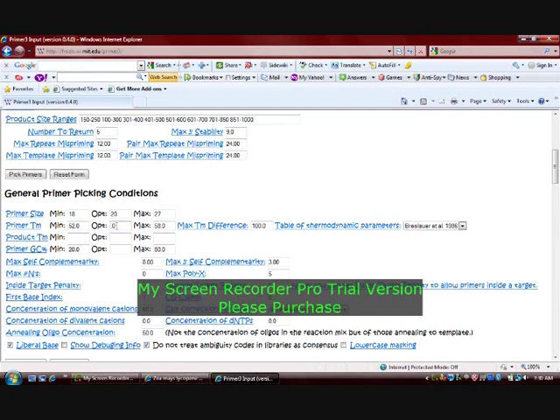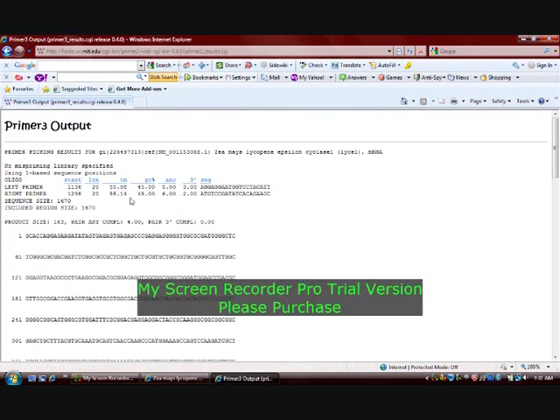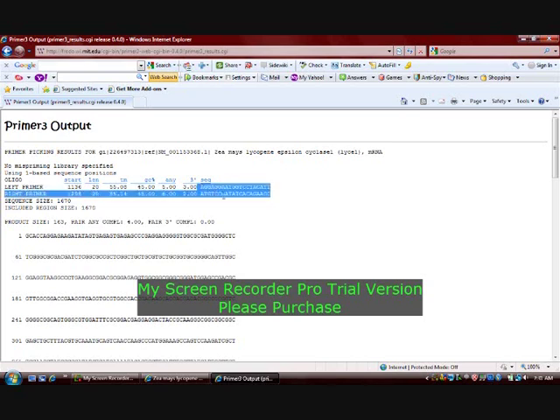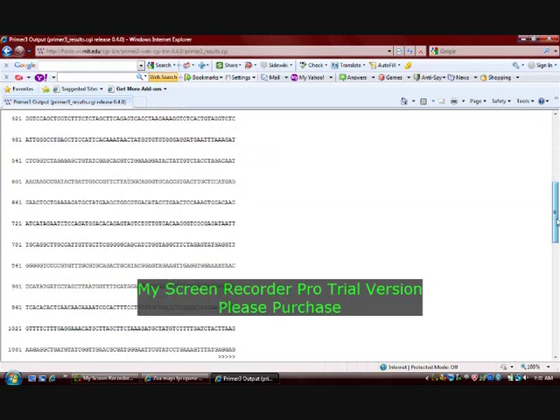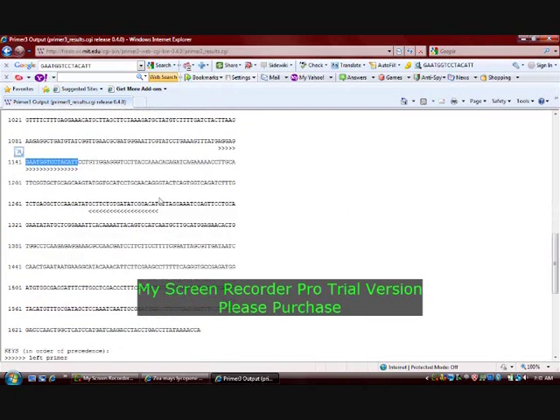The GC content is set with a minimum of 45 and maximum of 60%. Then the option called 'Pick Primers' is clicked. The output page is displayed and the primer picked by the software is shown. All conditions are met properly. In the sequence given, the positions of the forward and reverse primers are shown. As we scroll down, we can see 4 other primers that have been designed.